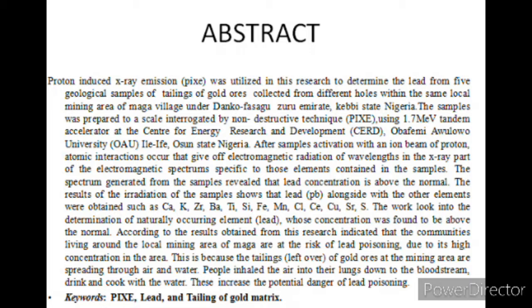After sample activation with an ion beam of protons, atomic interaction occurs that gives off electromagnetic radiation of wavelength in the X-ray part of the electromagnetic spectrum specific to those elements contained in the sample. The spectrum generated from the sample revealed that lead concentration is above the normal.